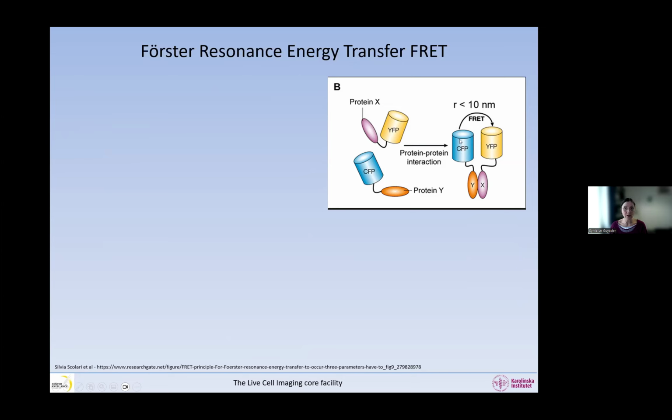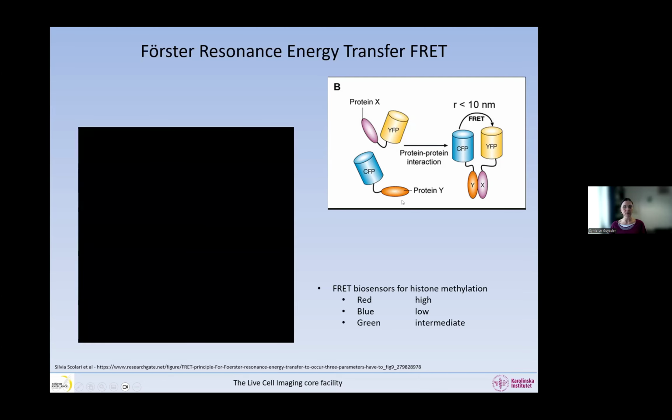It is not the case that CFP is fluorescing and that light is exciting YFP. That's not the way it works. It's an energy transfer. CFP will not fluoresce, and YFP will not be excited by light. It will be excited by the energy that is transferred from CFP. So this is FRET, and it's also very useful.